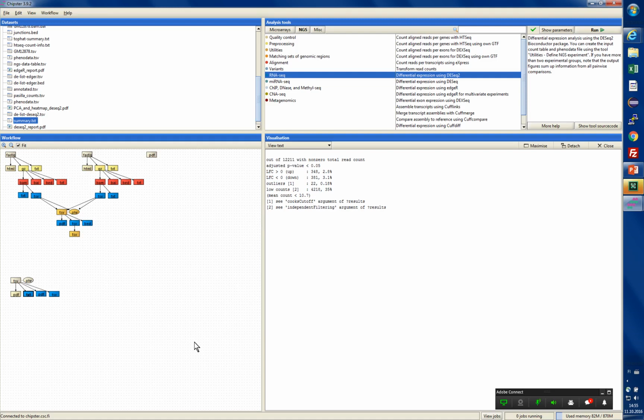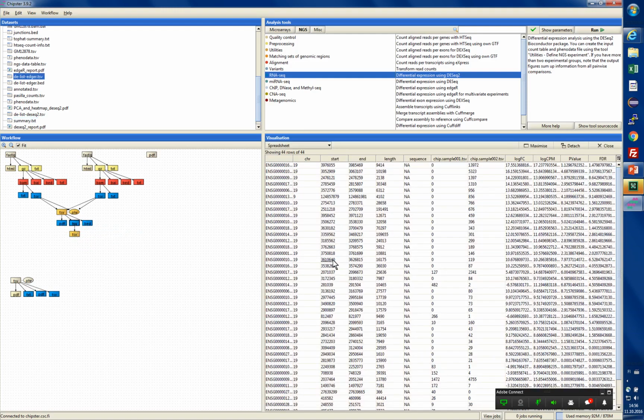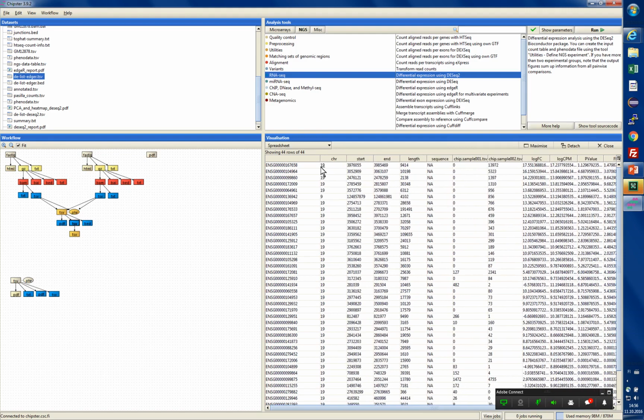So, we have pretty much completed this. Maybe one thing I forgot to say earlier is that up here I didn't discuss these files, but they were also differential expression analysis, though it's not very meaningful if you don't have replicates. So I don't want to look into them in a lot of detail, but I want to point out that in the result files you have these Ensembl identifiers for the genes, which are a bit awkward, so you can always annotate them.